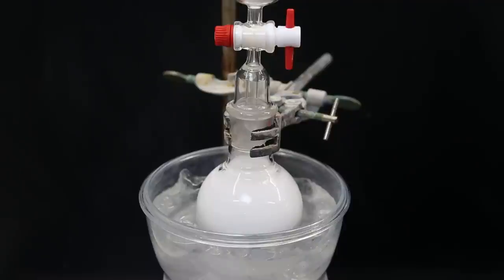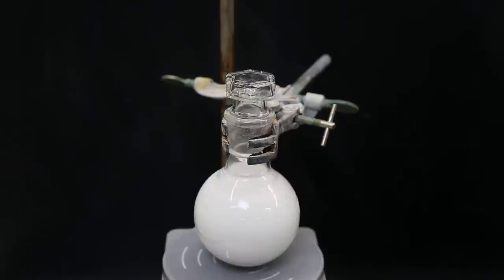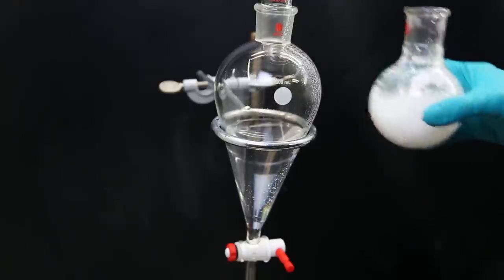When the addition is done, the reaction mixture has turned completely white, and I just leave it to stir for a few more minutes. After that, I remove the dropping funnel and the ice bath, and then leave it to stir for a few hours at room temperature, to make sure that the reaction is complete. When that is done, I move the reaction mixture to a separatory funnel, with the help of some more pentane.